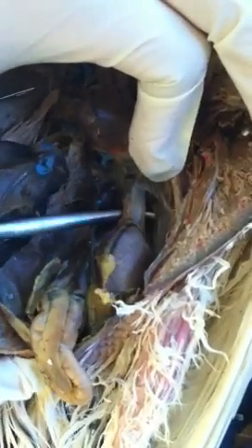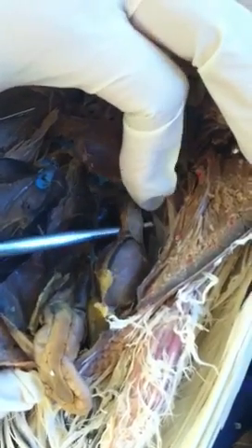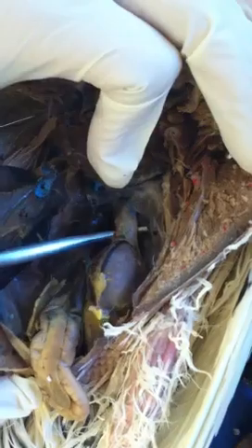Here in the abdominal region you will see the gizzard. If I take it out, it's a heart-shaped structure — it's actually pretty big. You will also see a tube connected right to the gizzard; that's the proventriculus. Remember, the proventriculus and gizzard work together as the stomach.